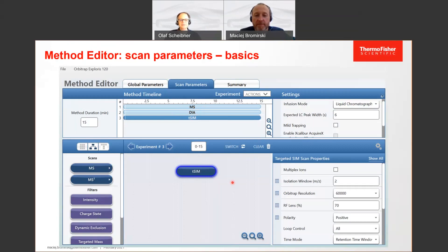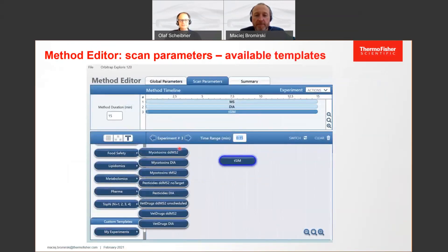In order to make life easy, it's not only that you can design these methods yourself — we also provide a good set of methods that are already pre-designed according to application notes we have published and methods developed in our own application labs. These include things like the Pesticide Explorer with its compound list and corresponding method, or the Vertex Explorer where the method is integrated into the instrument control software. These templates are updated on a regular basis, and as long as you have internet access from your acquisition system, you can update them online whenever useful.